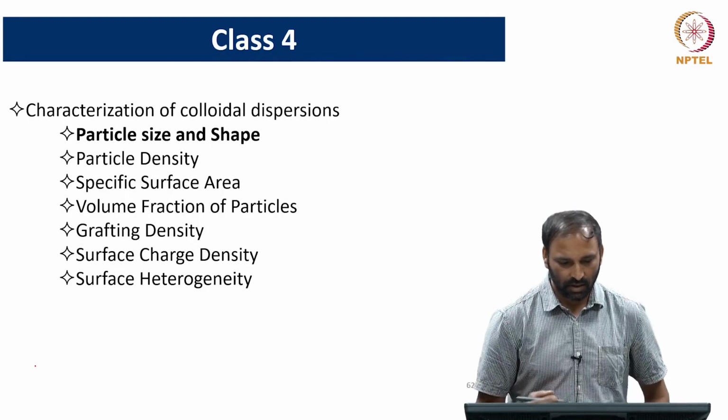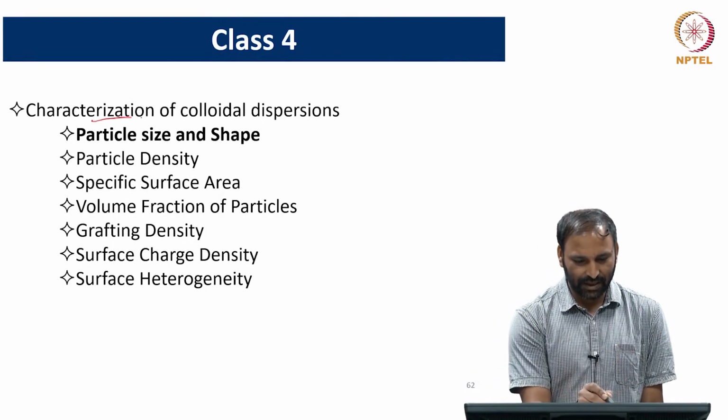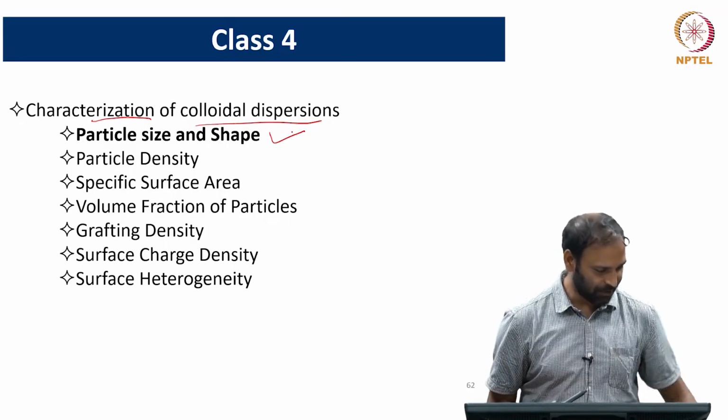Okay, so this is class 4. We will continue with characterization of colloidal dispersions. We briefly started looking at how to characterize particle size and shape.